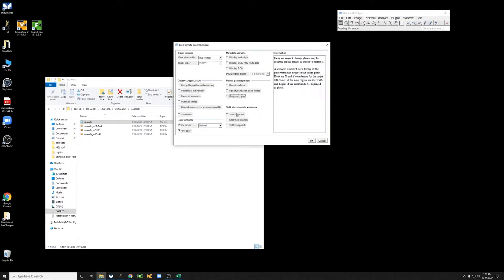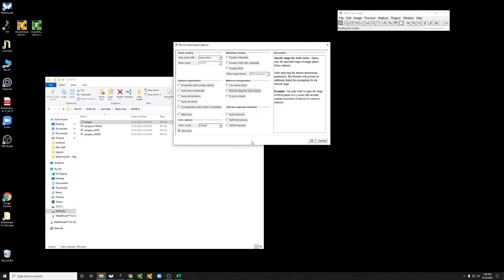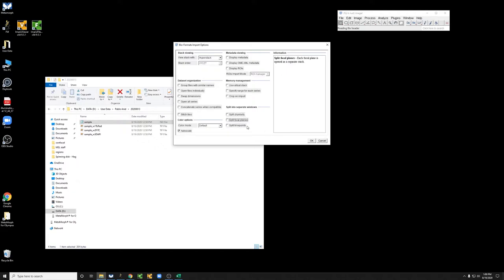check that all of these settings are what you want. You don't want to split the channels, for example, or the time points or the focal planes. Auto scale is fine.